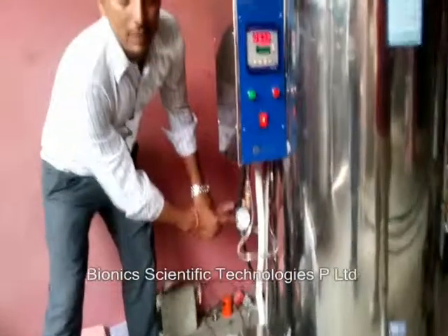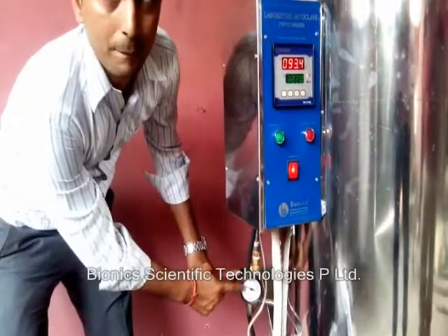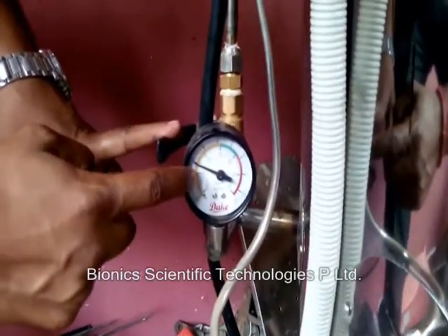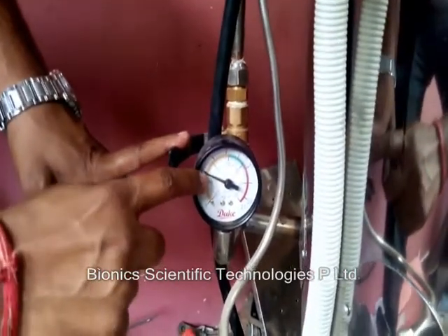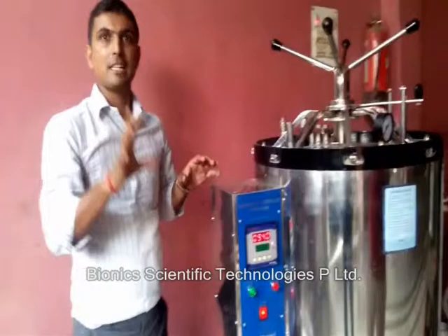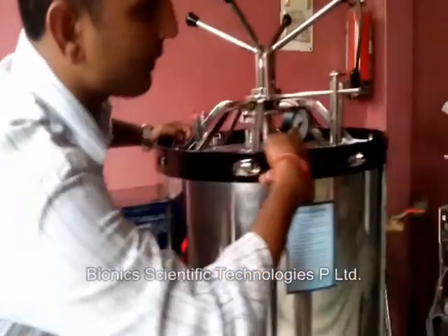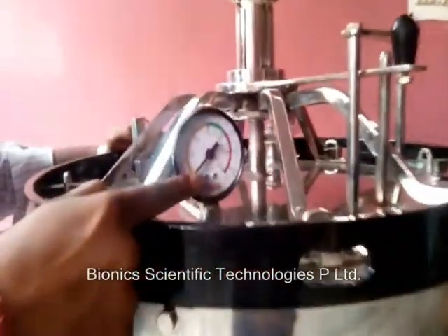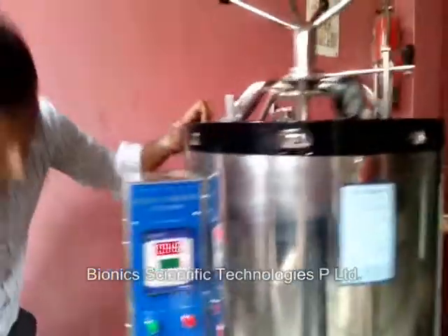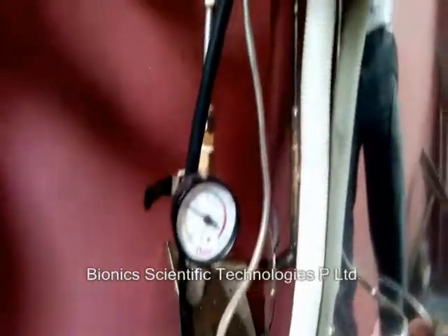Now you can see the pressure is increasing on the pressure gauge. This pressure gauge is showing more than 5 PSI. Basically this is the pressure of the jacket, not inside the chamber, because the chamber pressure will be shown by this pressure gauge. It is showing no pressure inside the chamber. When it reaches 15 PSI, we have to transfer it from the jacket to the chamber.